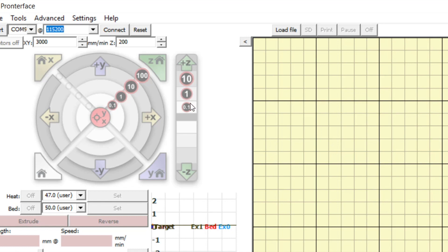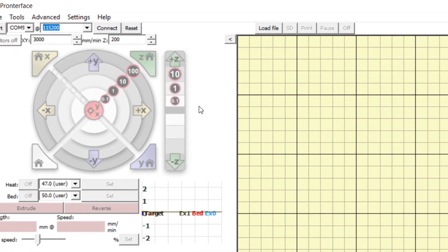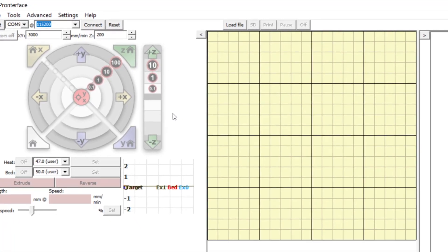You can also control the Z motion using the buttons to move the bed up or down by 0.1, 1 or 10 mm. The Z corresponds to the distance between the extruder head and the bed. So positive Z will lower the bioprinter bed, increasing the distance between the bed and the extruder, while negative Z will move the bed up.